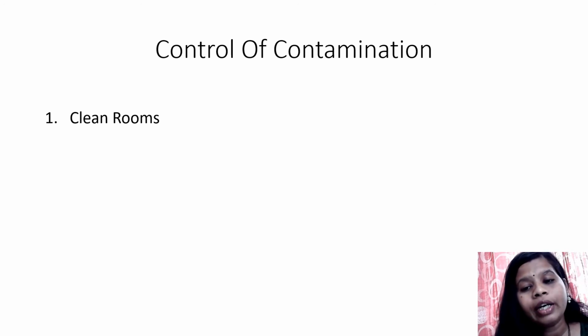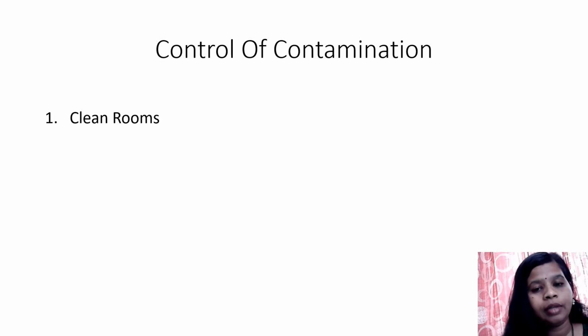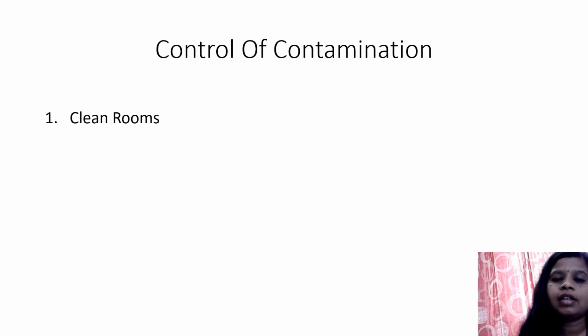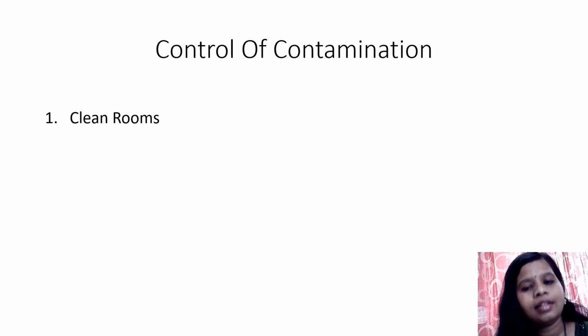So as to avoid it, these surfaces should be clean and easy to clean or disinfect properly. Instead of using other materials which behave as a source of contamination or shed some particles in the area, materials like stainless steel or glass will be used, so that they can be easily cleaned and will not corrode due to the cleaning and disinfection process.